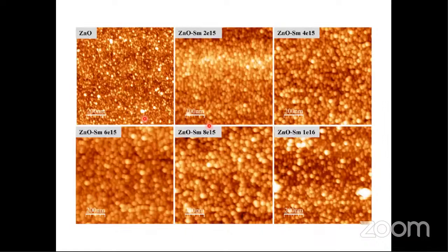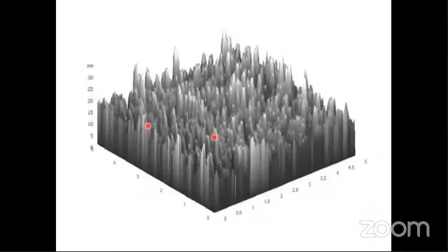So these are more or less about optical imaging and optical spectroscopy in materials characterization. There are also several other processes to study the surface characterization, but these are the most commonly available and easy methods for studying the surface structure of the material.